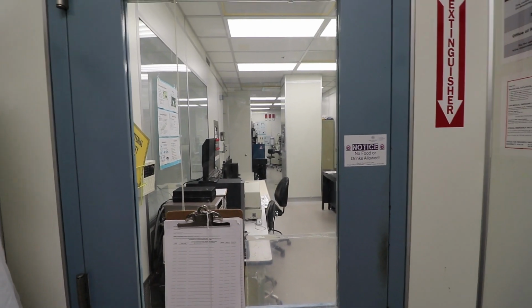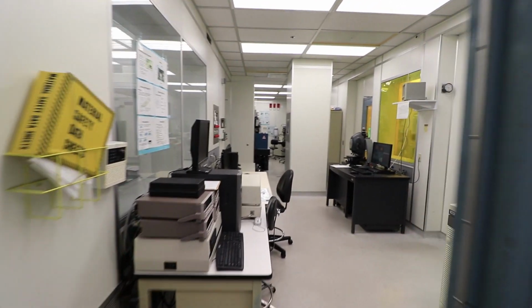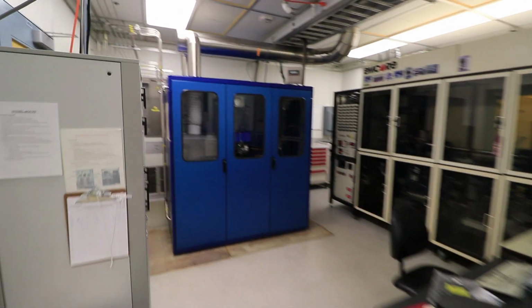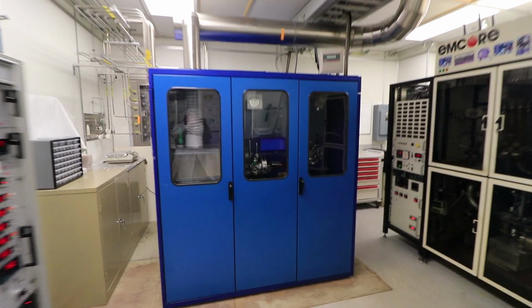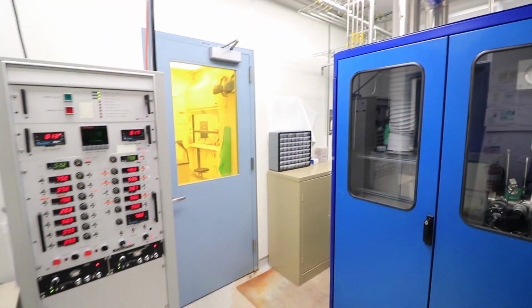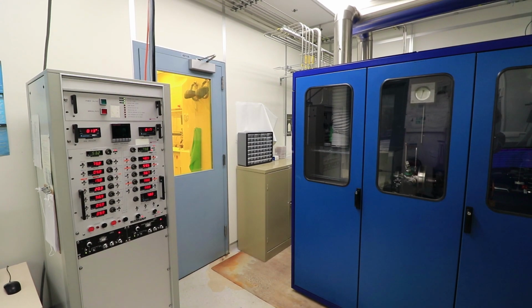There are three metal organic chemical vapor deposition, or MOCVD, systems, and two molecular beam epitaxy, or MBE, systems, available for material growth. An FRL horizontal flow MOCVD is available for the growth of arsenic and phosphorus-based 3-5 compounds. It is a horizontal flow reactor with a maximum temperature of 900 degrees C and is used with samples with an area up to 10 square centimeters.